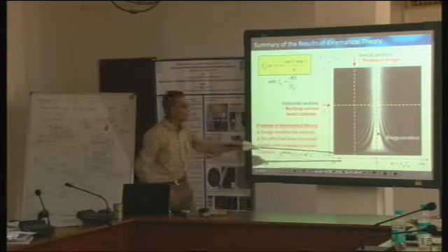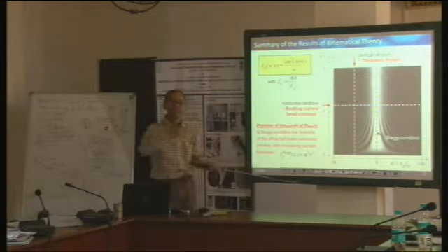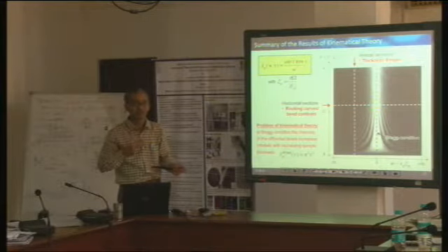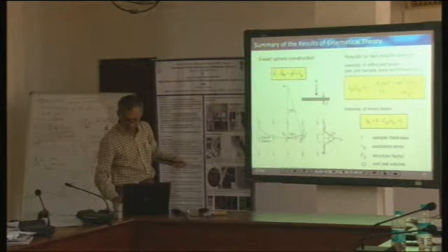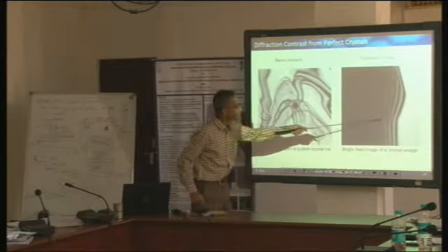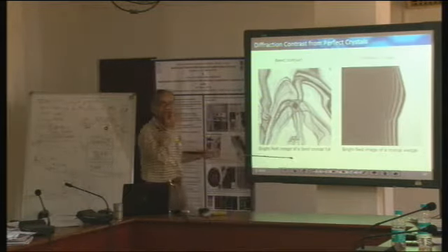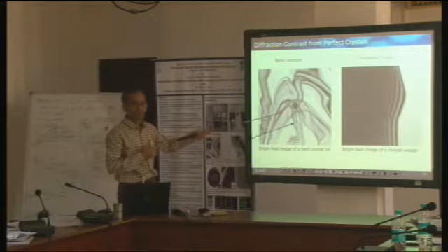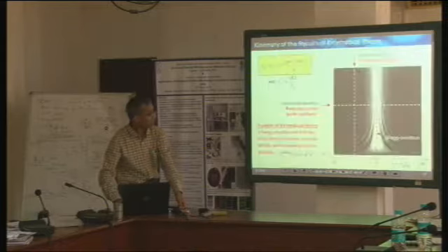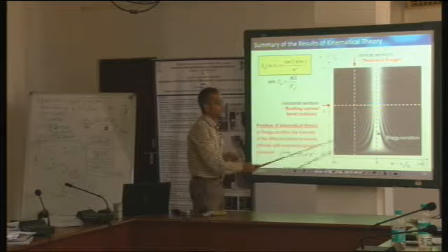So it fails when S is equal to 0, but when S is away from 0, then it is able to tell us at least qualitatively the way we observe things in our images, like we observed here: as the thickness increases, there is a dark, bright fringe pattern, and that's what we see. So these two cases we have seen, and we will now talk about the other case.